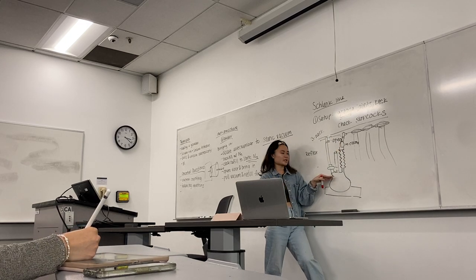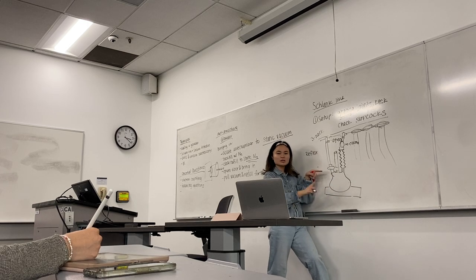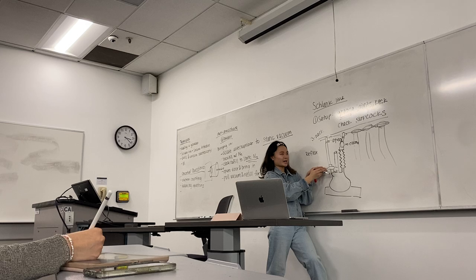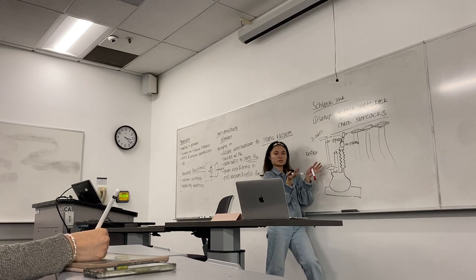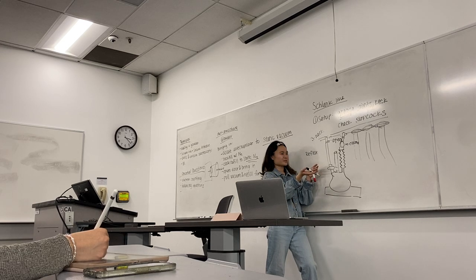The reason for this, and I saw this so many times, is because you want to minimize the chances of the solvent vapors getting into the line. Even if it's under reflux, under positive pressure of nitrogen, there's still a chance, and you want to minimize that chance. So one of the most important things with closing and opening stopcocks is to be intentional about the order in which you open stuff, because if you, for example, leave this open during reflux and this closed during reflux, that's just not the most proper practice. Does anyone have any questions, or is there anything you want to add to that?